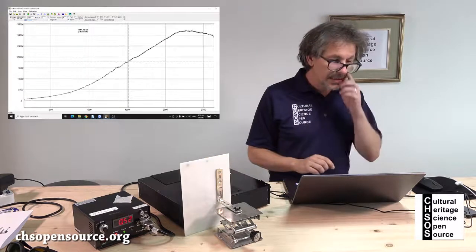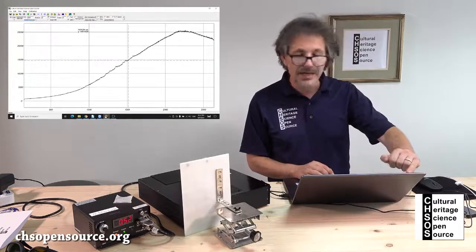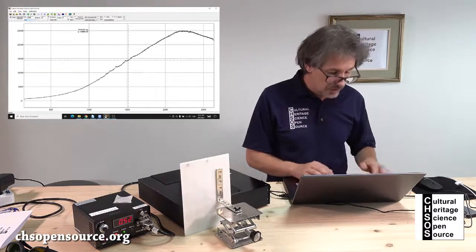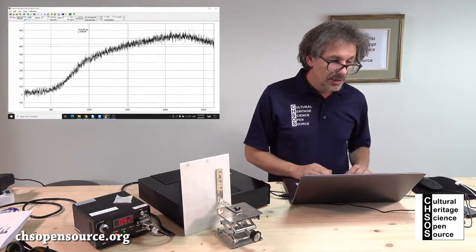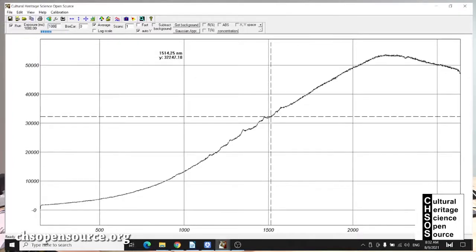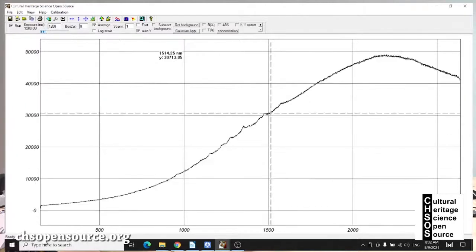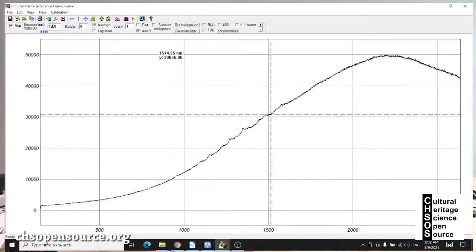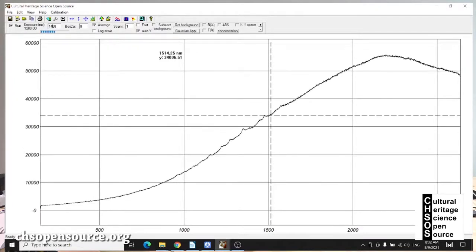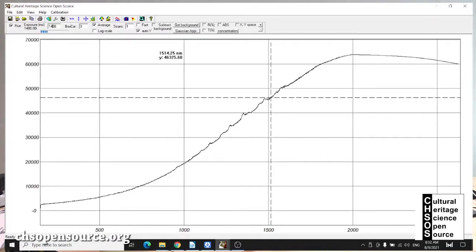Okay, wait here, and the acquisition time, you see, I need to increase it because now the maximum is 25. So at least I can use 1 second, so 1000 milliseconds over here, a little bit more, 1200. Even more, 1400. Okay, 1400 is the best.